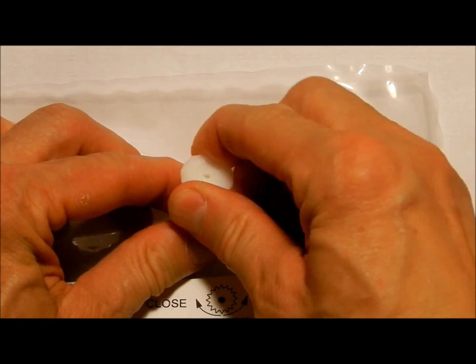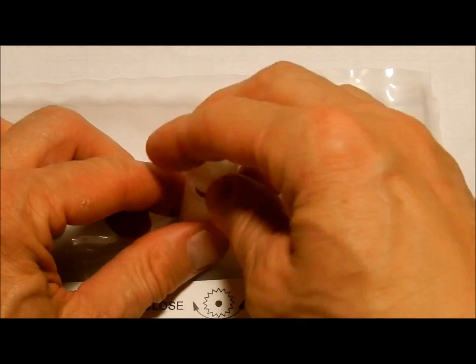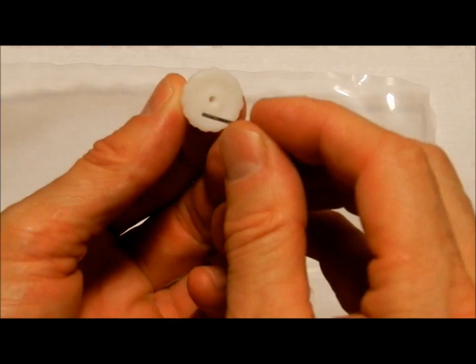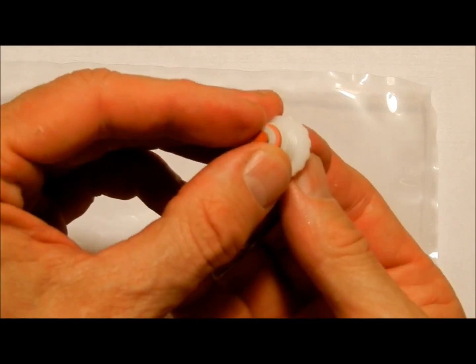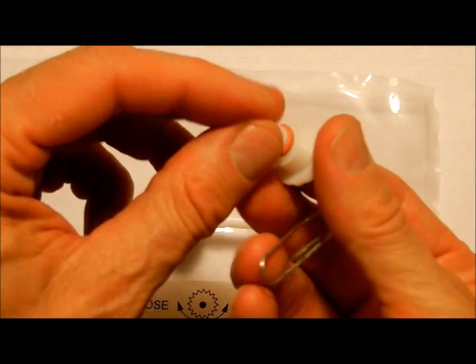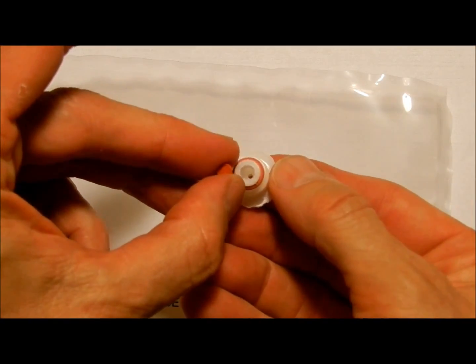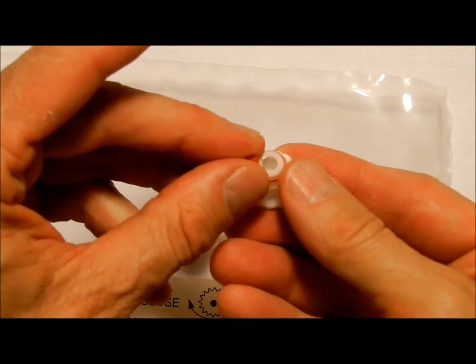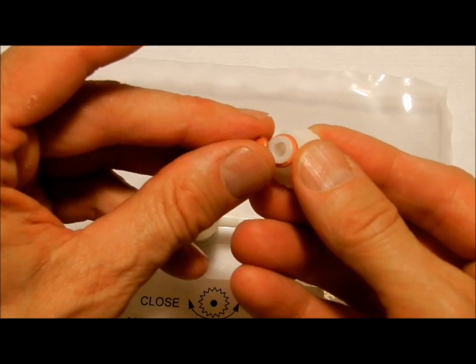To replace the septum, unscrew the valve all the way, remove the cap, and use a softer pointy object — but not too sharp — to remove the old septum. Get a new septum and place it into the cap, making sure that the Teflon-coated shiny side is facing towards the bag.